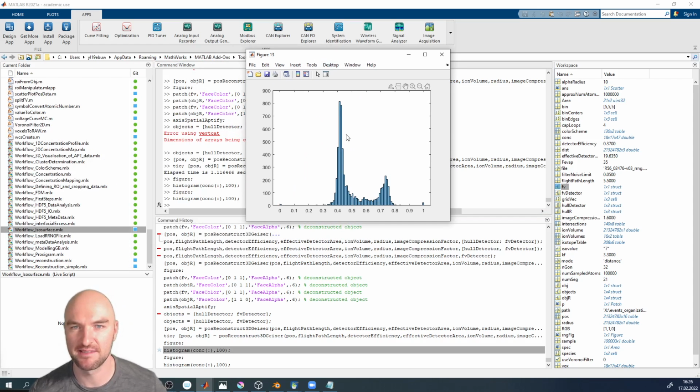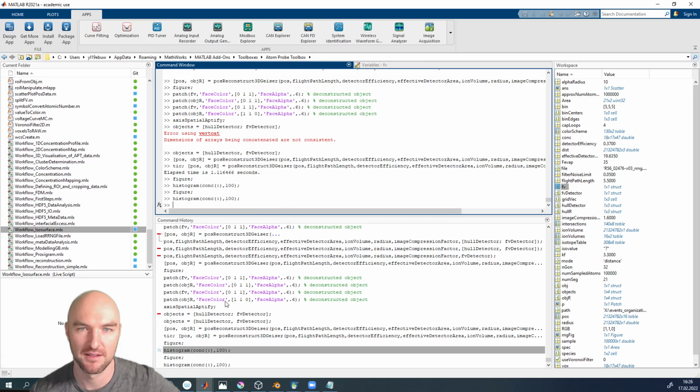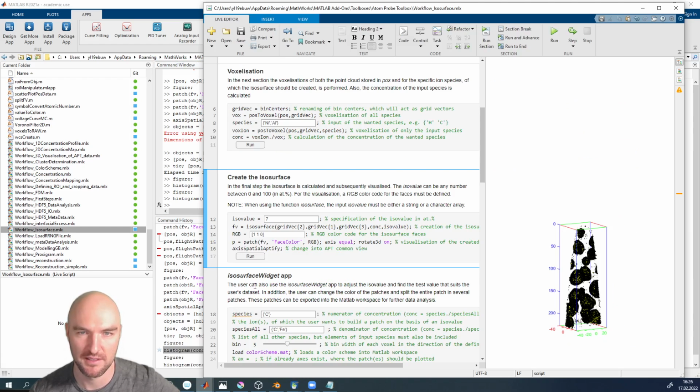Oh yeah, I guess that's some good separation between matrix. Yeah, so the matrix is probably here, and this is probably the precipitates, and that's some pretty good separation at a value of aluminium plus nickel of 0.6 roughly, or 60%. Okay, so now 60% is our threshold, because of course there's a lot of nickel in a nickel-based alloy.